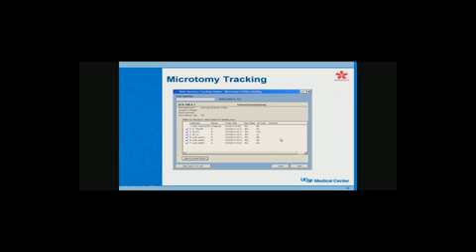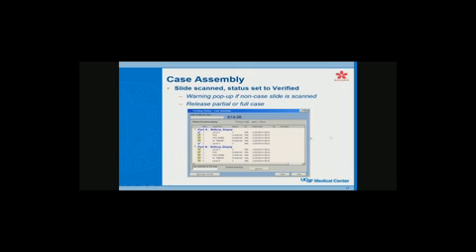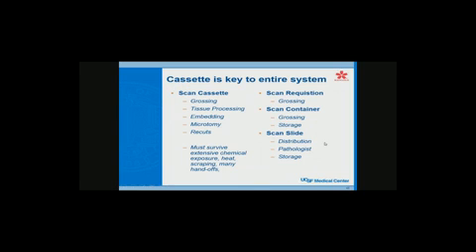Tissue processor, this is showing you scan the block in and this just shows the block that's put in the tissue processor. Embedding, this is what you see in embedding. It shows you what it is. If they put in the number of pieces, it'll show up. If there's any comments on the block, it'll show up here. So they see this for every single block. And then at cutting and sectioning, when they scan the block, they get the list of slides to cut.